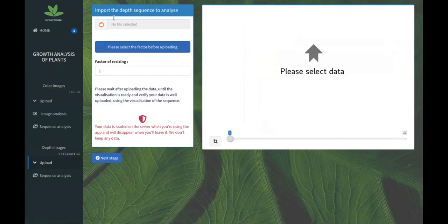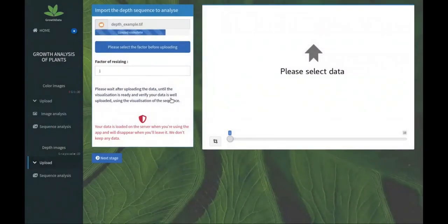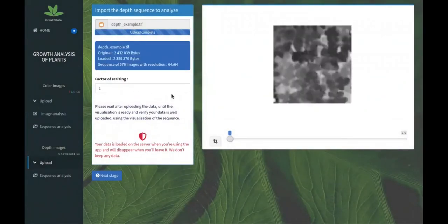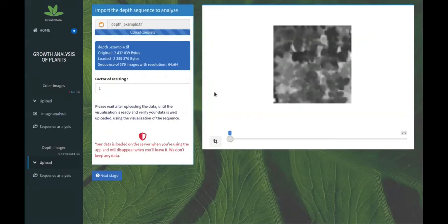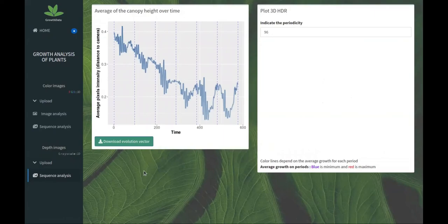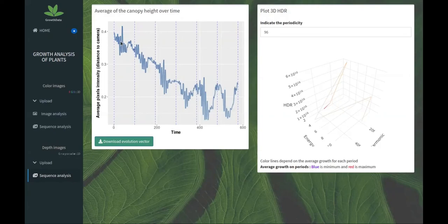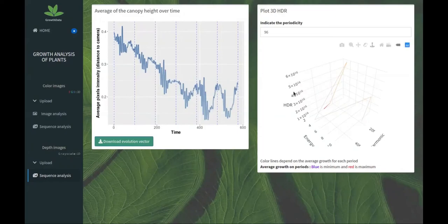Let's characterize depth sequences of images. Here we have a canopy of hydrangeas on top view, and we want to characterize the growth. We have on the left the average of the canopy height over time. It is the distance to the depth sensor camera. We can see different patterns: the daily growth, circadian patterns, or higher frequency patterns.